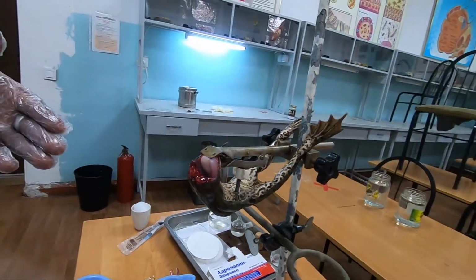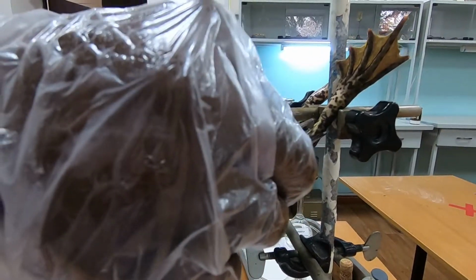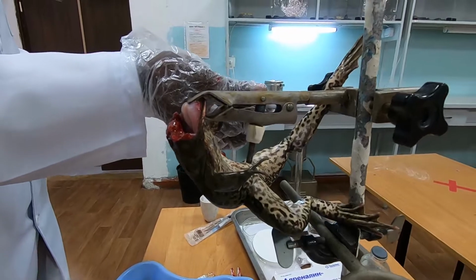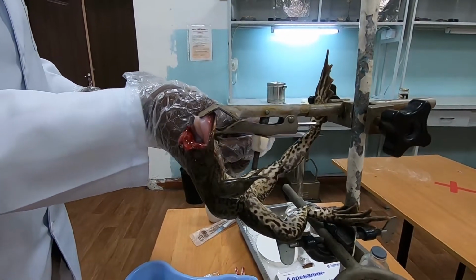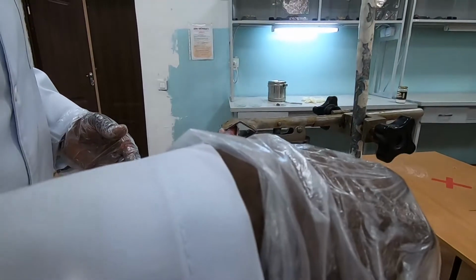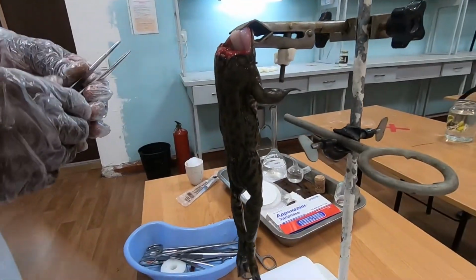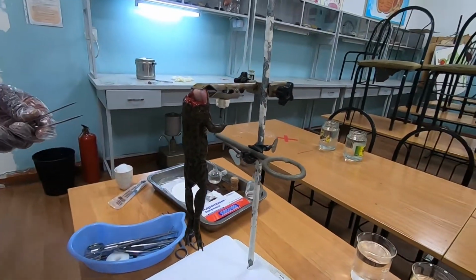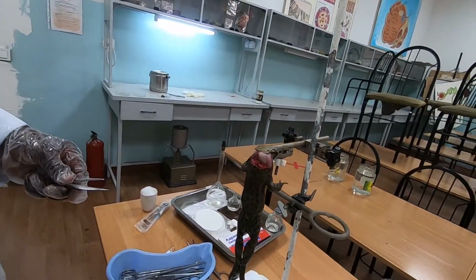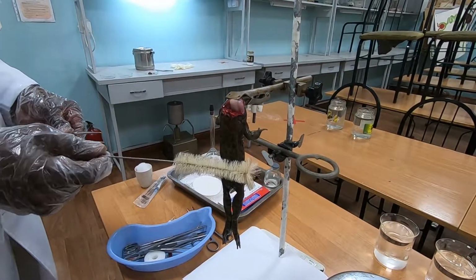Yeah, this is what I want to show you, dear students. Have a look and see how the frog is reacting. This is what we call the reflex action, when we touch some parts of the body. Now, we're going to use our brush. We have to leave it some few minutes. All right? And then we will use what?